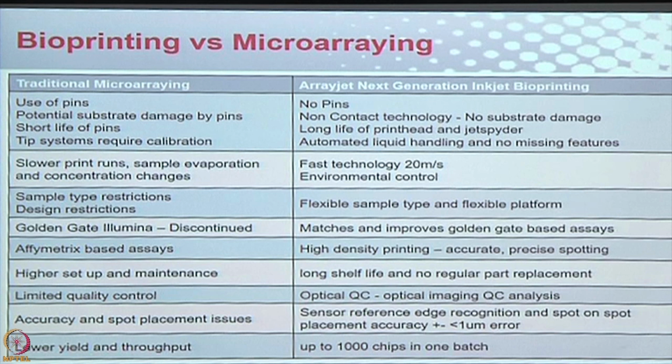So at the end of the run, you've not wasted your antibody. You're able to get a full set of data from that one printing, because it remembered that it missed somewhere, because maybe you missed putting the sample, or it was a bit sticky and it couldn't get aspirated. In many of these techniques, this software, which is called the iris as the eye, can recognize which, okay, slide number 1000 has my antibody 5 missing.